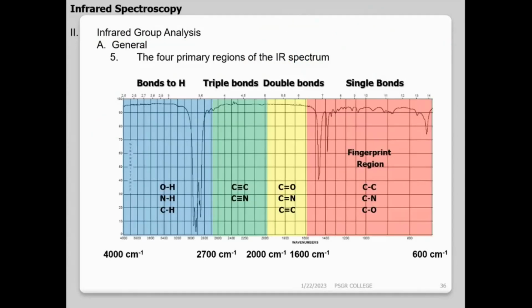Okay. So try to take a snapshot of this and keep it with you, in your phone. Very important slide, if you know IR. That's all. So I divide the IR spectrum into four regions. All primary colors I'm using: blue, green, yellow, red. Okay?